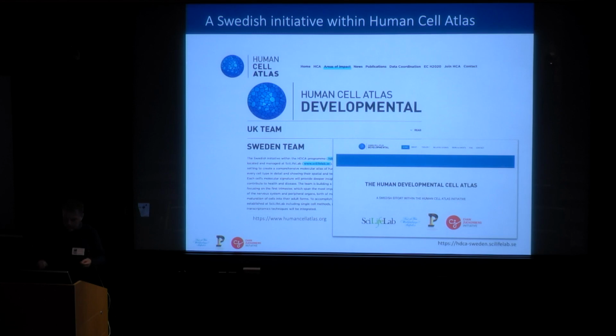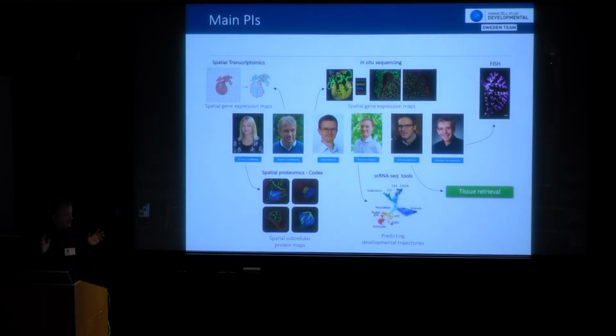And I'm a technologist, so we have a fantastic set of technologies at SciLifeLab, providing different measurements into the same organ. I think this is a fantastic tool for you guys as computational, because this will be a very rich resource. So we have Emma Lundberg doing proteomics using Gary Nolan's technology of CODEX. We have myself doing spatial. We have Mats Nilsson doing in situ sequencing that I mentioned early on. Sten Linnarsson is doing single cells. We have tissue provided by Erik Sundström, and Christos is doing some FISH analysis.